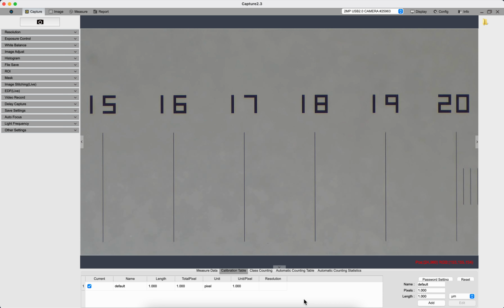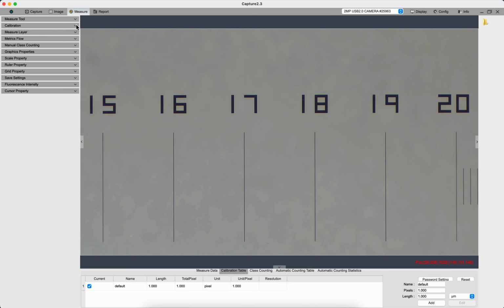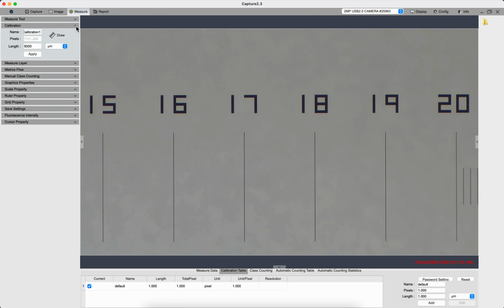To perform calibration and measurement with the software on your PC, start the program and click Autofocus. Make sure the C-mount checkbox is clicked. This will bring the camera to the default position, which is necessary for both calibration and measurement. Then move to the Measure section and click the second tab, Calibration.